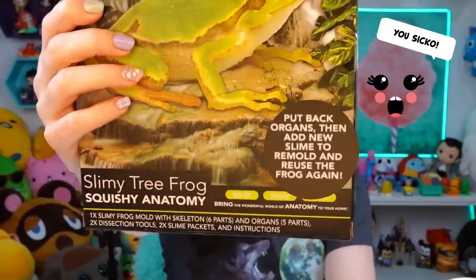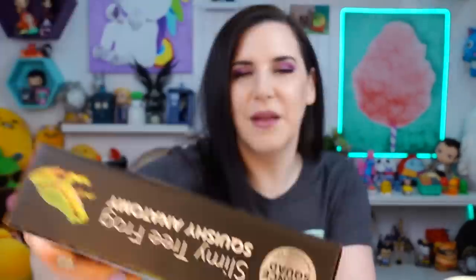Let's do a frog first. I kind of want to cut into this little guy, put back the organs, and add new slime. When you're done, try that in your biology class — I dare you, just shove them all back in there and he's perfect. Let's dissect a frog! Ooze tube — I just like saying ooze tube.